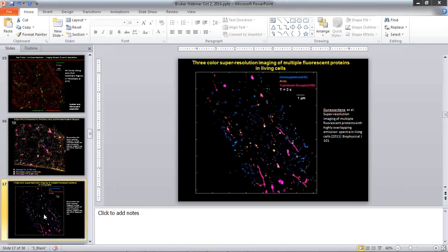But if you are not able to image at 600 frames per second, the fast movement of the molecules would blur anything that you'd be able to extract useful information from. So you do want to be able to image as fast as possible and then figure out the right binning, so to speak. So in this case, we binned it at 2 seconds to be able to actually look at the clathrin or transferrin or whatever we were looking at.